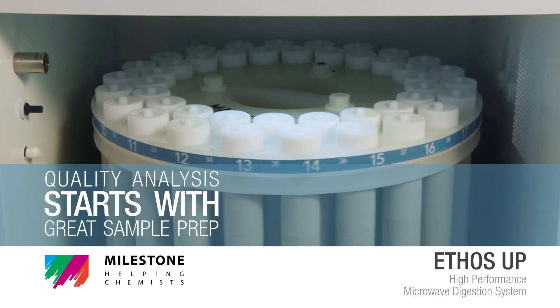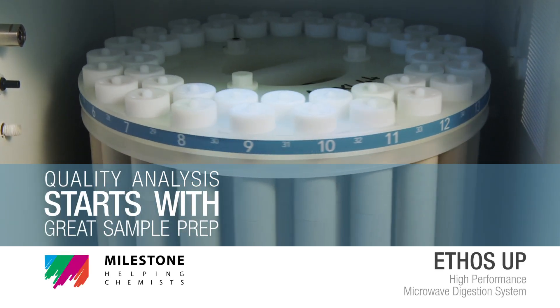Ethos Up. Quality analysis starts with great sample preparation.